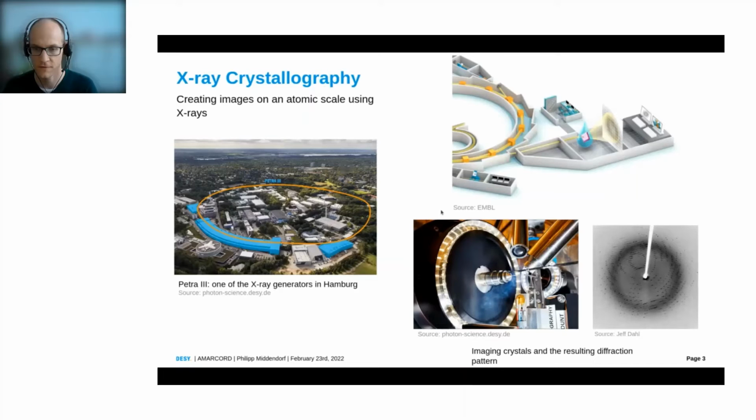You have to trust me that there is software that is able to interpret this weird image. Specifically, you might see these black dots, and the arrangement and the size and the intensity of these dots can then lead to an image of a protein, for example.